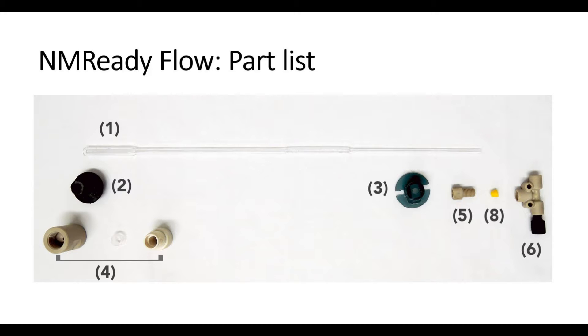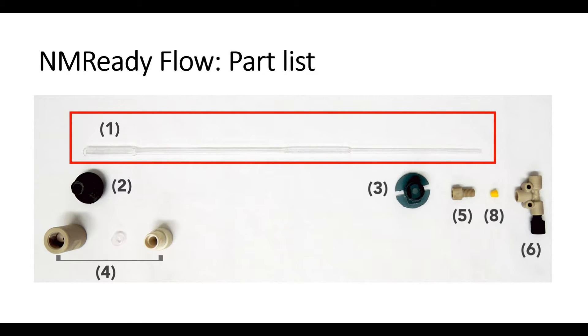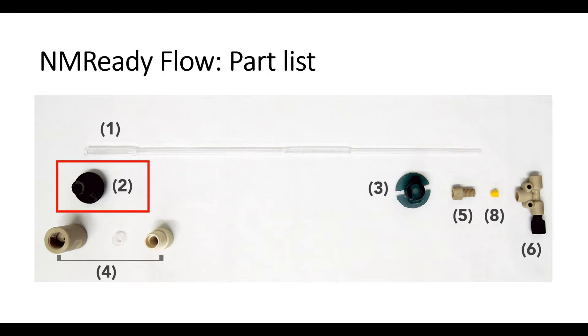Let's go through the kit inventory. Each flow cell kit is comprised of the following pieces: two borosilicate glass flow cells — only one is shown in this image — a top cap adapter, and a bottom plug adapter.